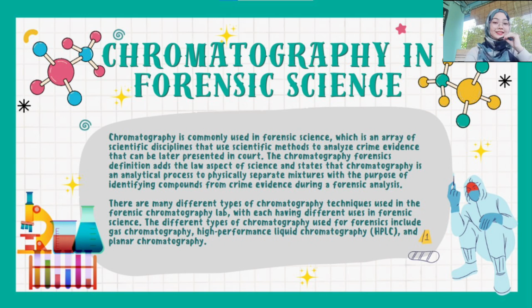Chromatography and forensic science. Chromatography is commonly used in forensic science. The chromatography forensic definition adds the law aspect of science and states that chromatography is an analytical process to physically separate mixtures with the purpose of identifying compounds from crime evidence during a forensic analysis.